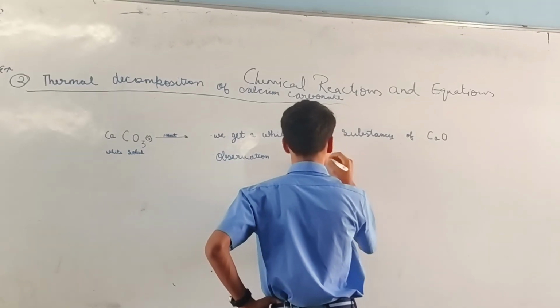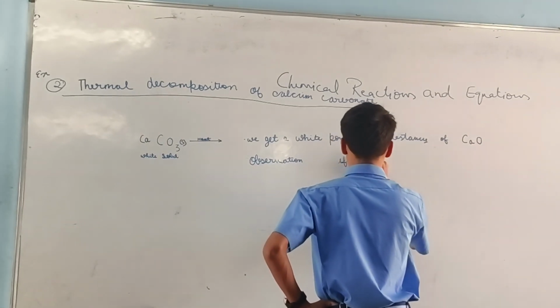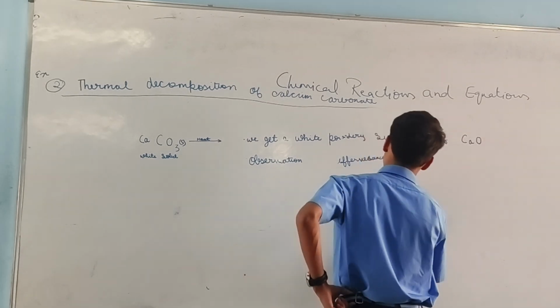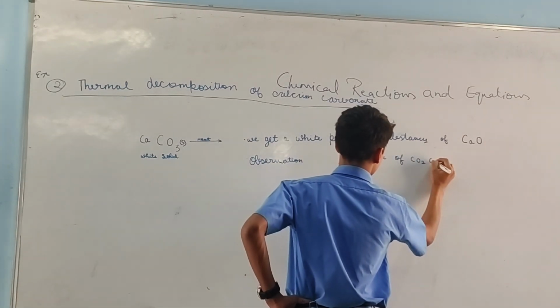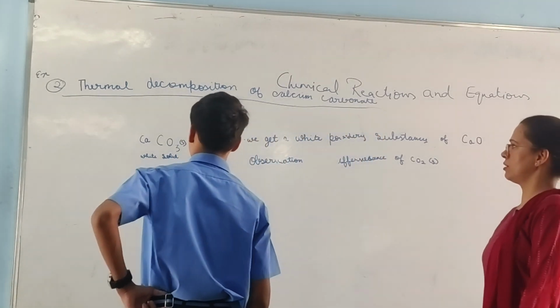Effervescence of CO2 gas. Right. Write the reaction.